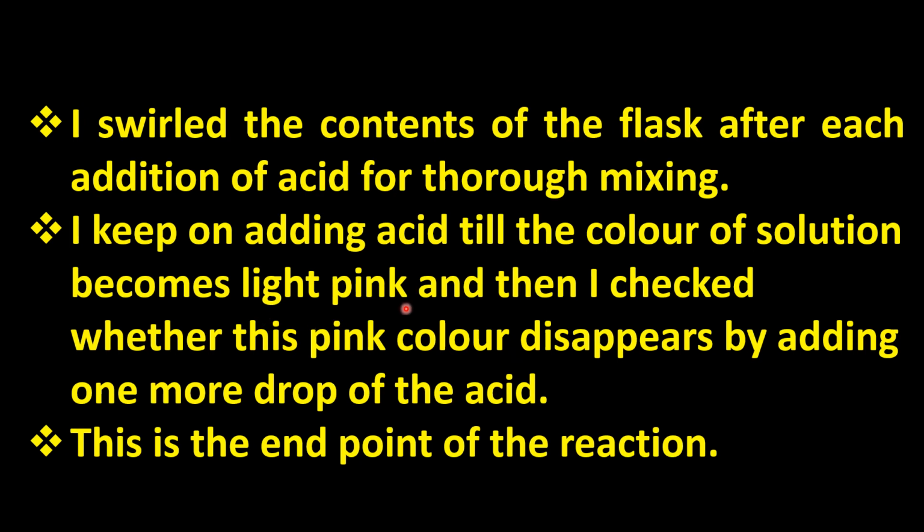Please memorize that you don't have to add all the acid into the base frequently. You have to add it dropwise and slowly. When you add it frequently, what happens? The color will discharge in just seconds and you will not get the end point. The end point is not colorless. The end point is light pink color.